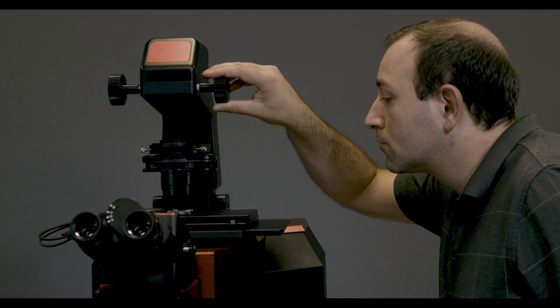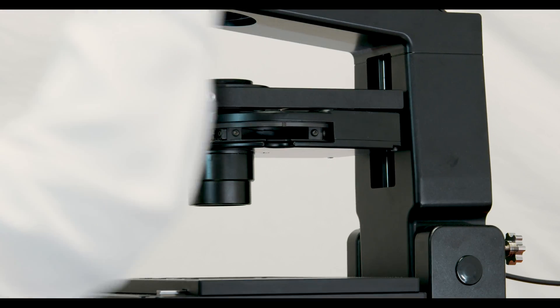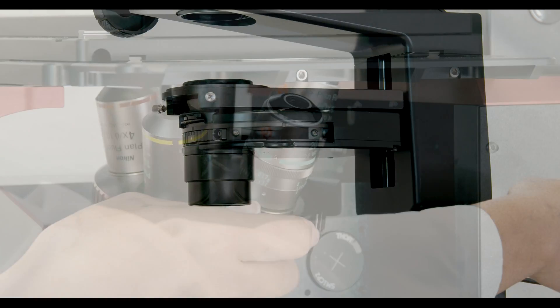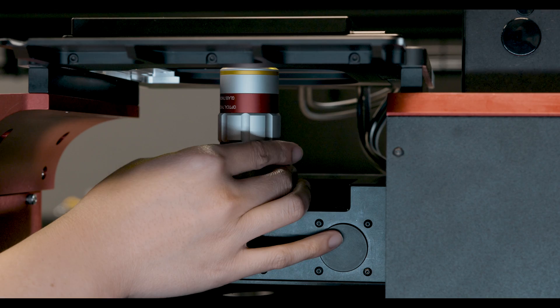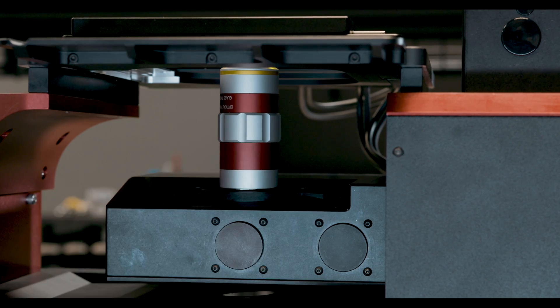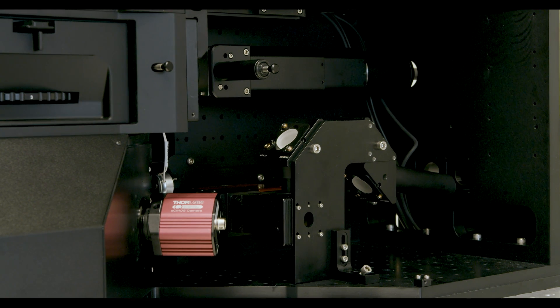I think the Veneto is going to disrupt the market, and the reason for that is we've offered so many different interfaces and means to do various different experiments, and have a platform that not only works today but also works in the future and allows you to develop new techniques. If what you have now works for the next 10 years, great, but if you find that your needs change, it'll be ready for those changes. It's ready to accept whatever you throw at it next.